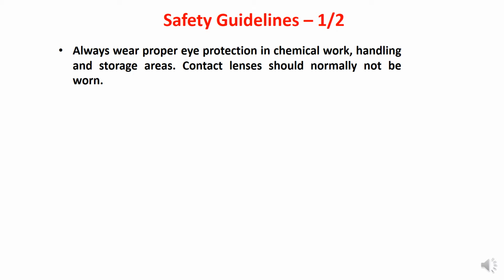In a couple of slides you can find the few guidelines I prepared for this lecture. Whenever you enter the storage area where the chemicals are stored, you need to wear eye protection PPE, although you already wear the basic PPE, for example the lab coat and gloves. This is important because we are not sure which chemicals may evaporate in the storage area.